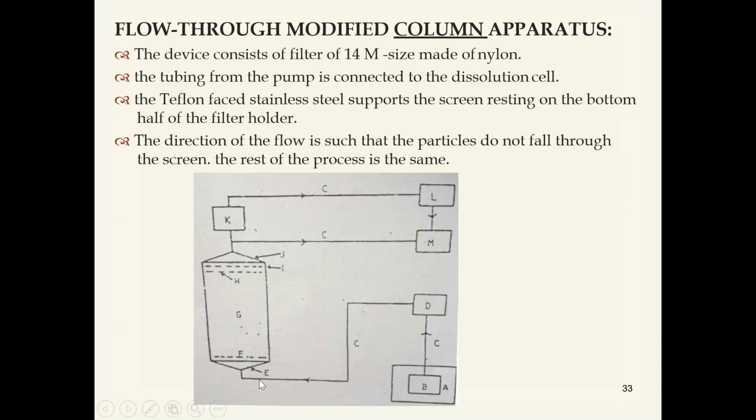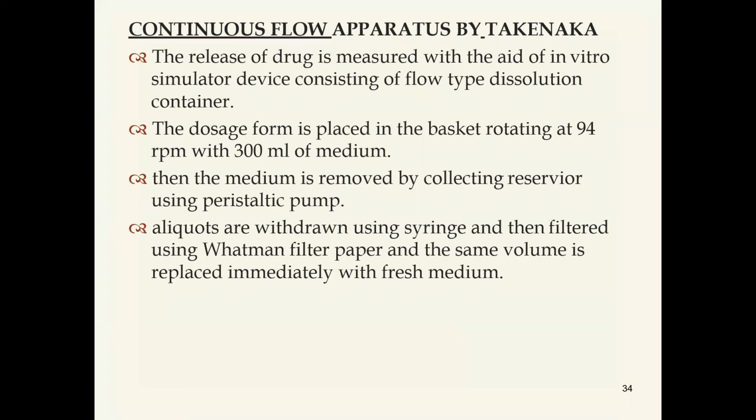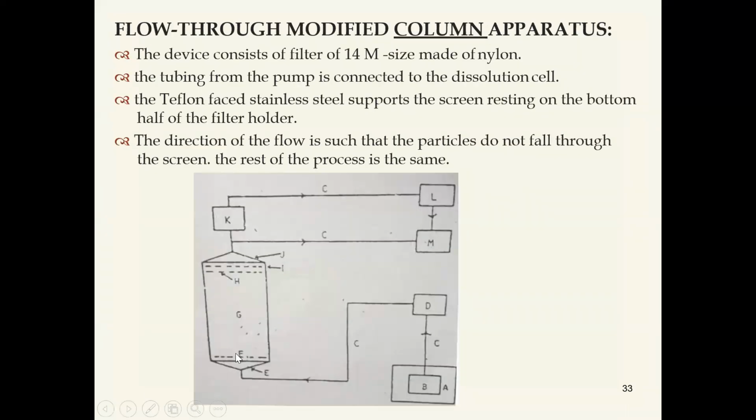Next, E. Where is E? E is here. This is the filter holder. Next, F. F is here. F is the support screen.